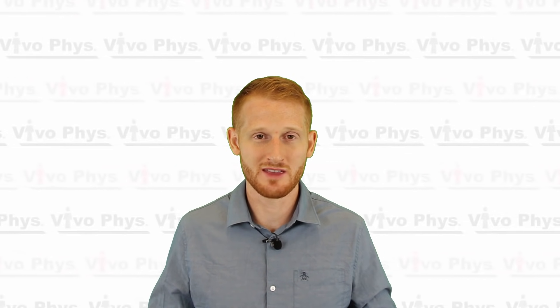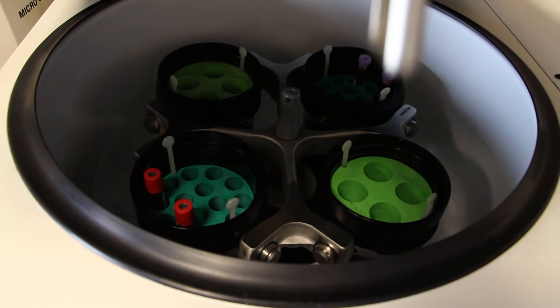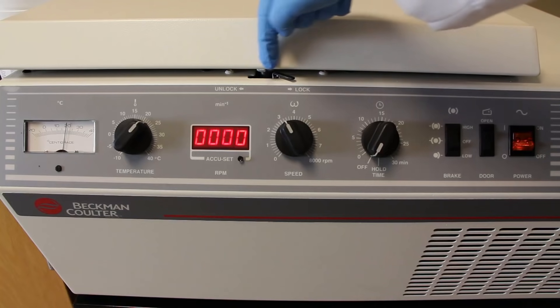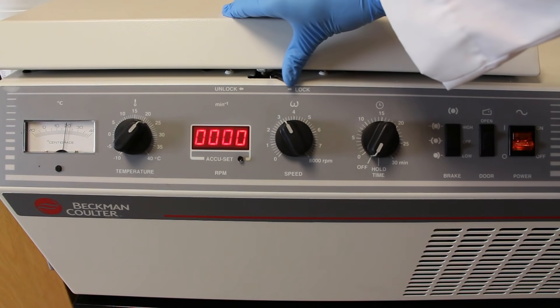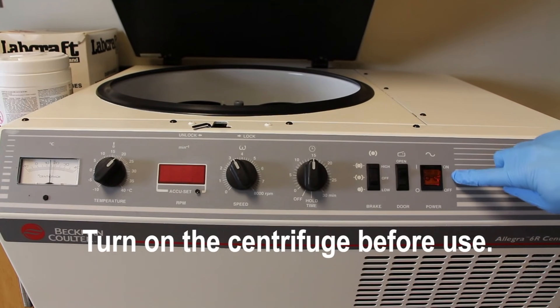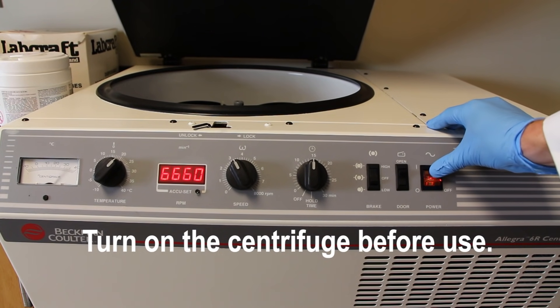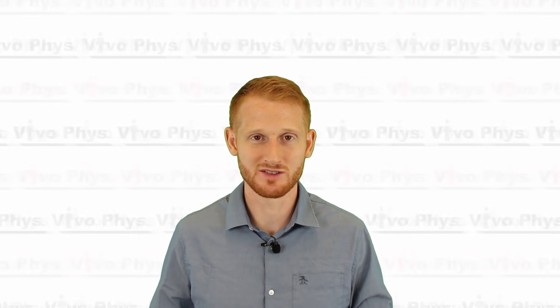Once the tubes are in the centrifuge appropriately, press the lid down until it clicks, move over the locking mechanism on the lid, and then you're simply going to turn the centrifuge on if you haven't already and hit the button if there is a button to start to spin. This particular centrifuge does not have a button to spin; you just turn the timer to whatever you want it to be set at and that's going to initiate the spinning process.